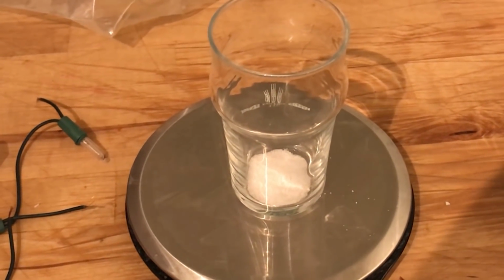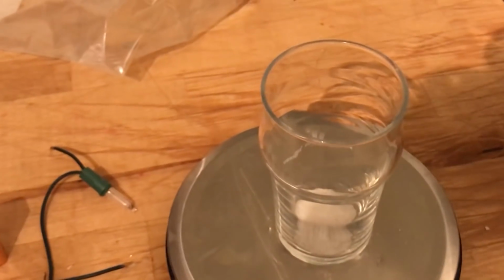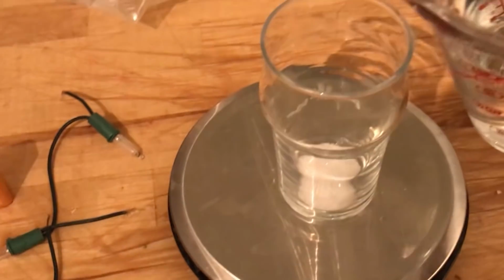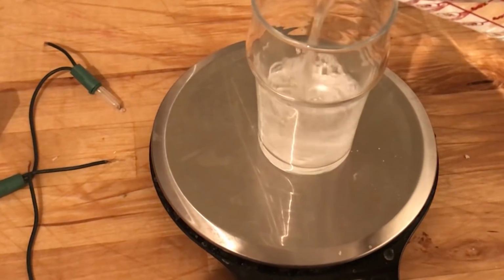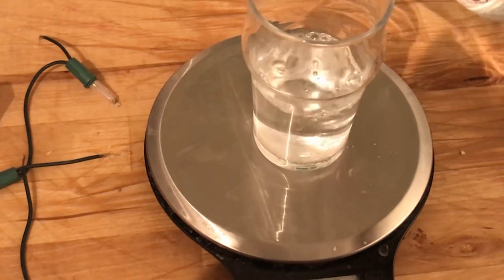Now what I need to do is add water to it. I'm going to add until my mass is approximately 100 grams.